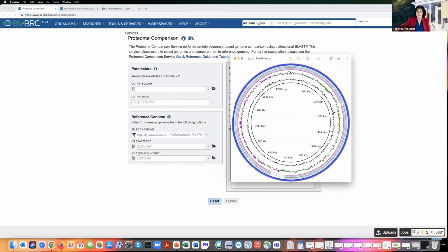So one of the things they did was this gene comparison. Can we do something similar? Remember, these were three different genomes, and the colors within each ring, stronger colors meant more homology, lighter colors meant less homology. And this was a tool by Rory.